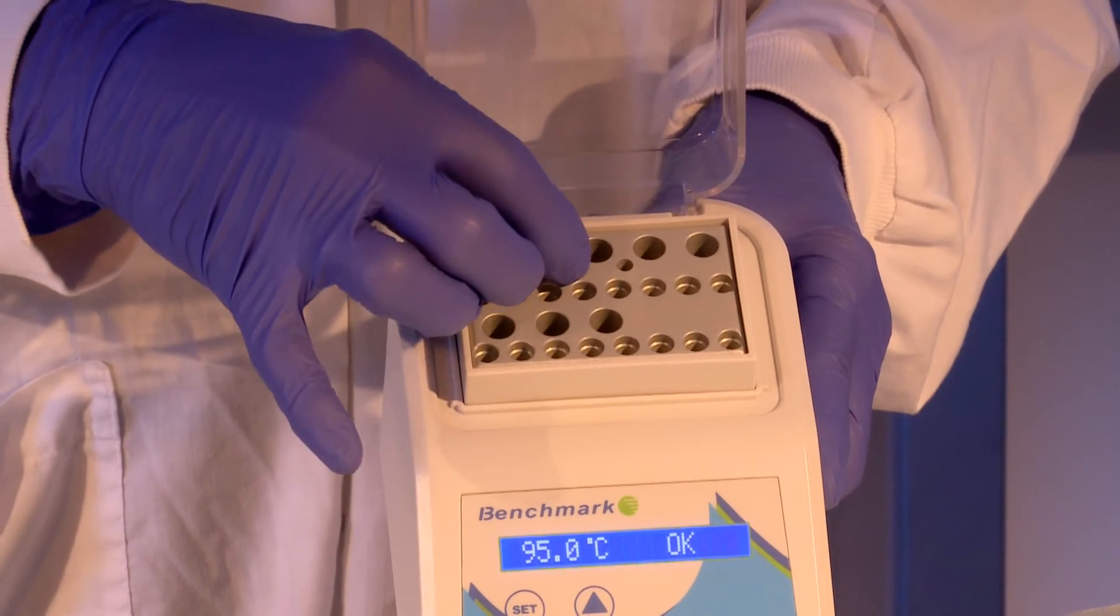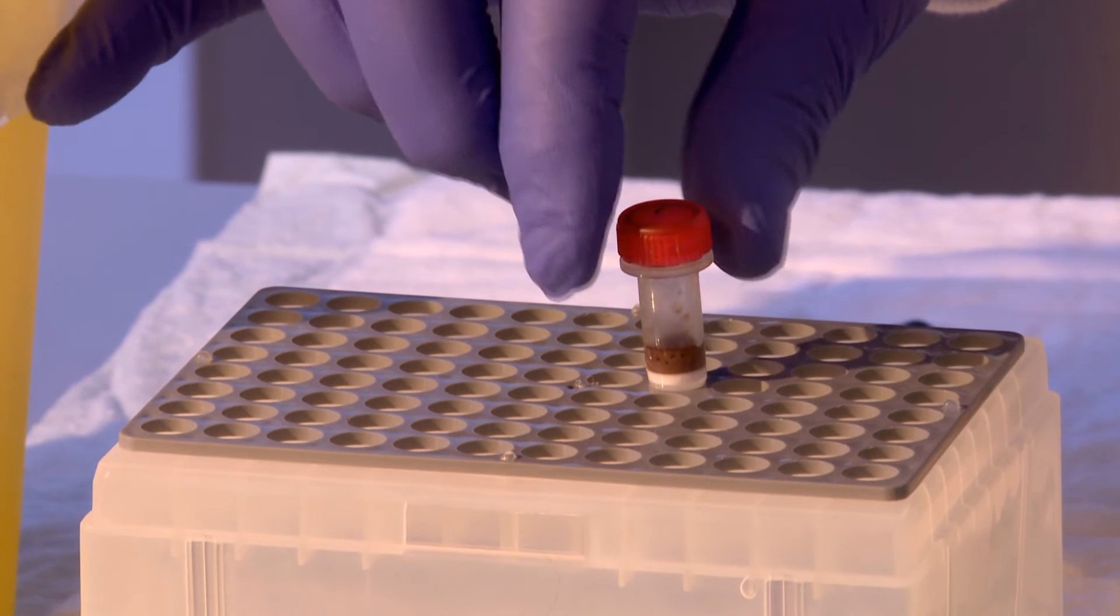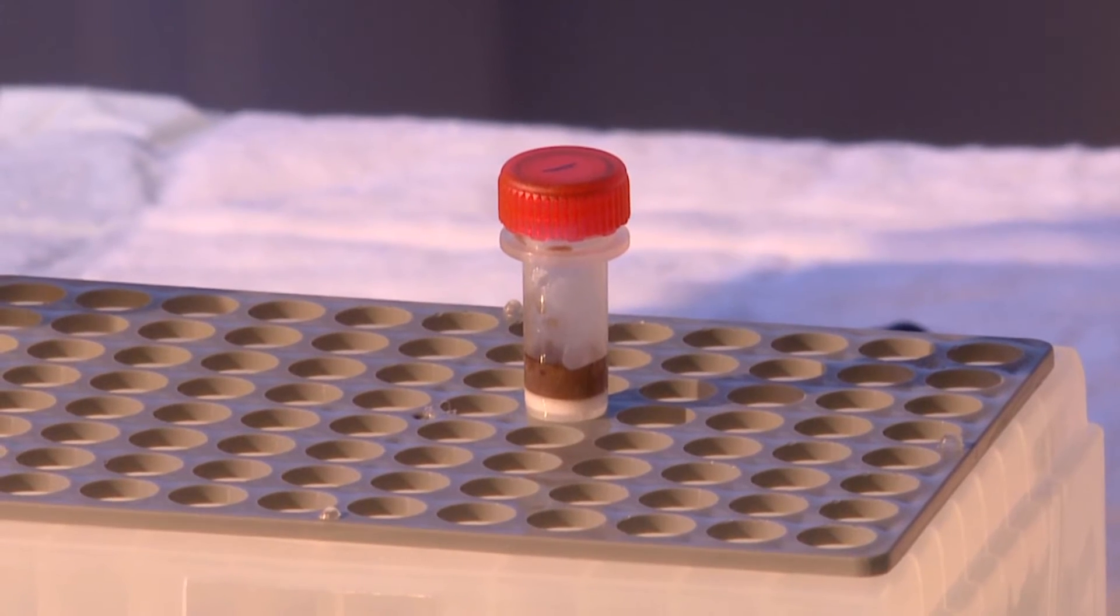Remove the column from the heat block and loosen the red cap. The blood sample will have transformed into a dark red solid clot. Allow the sample to cool for one minute at room temperature.